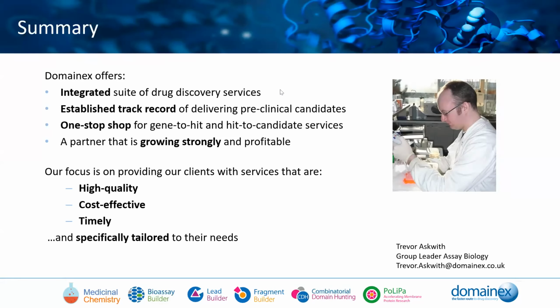The next question was, what experience do you have of all proteins working using MST as an assay platform, and what percentage success rate? Domainex brought in the MST about 6 years ago, so we were very early adopters. At the moment, I don't believe we've had any failure to develop a sensitive assay for MST.